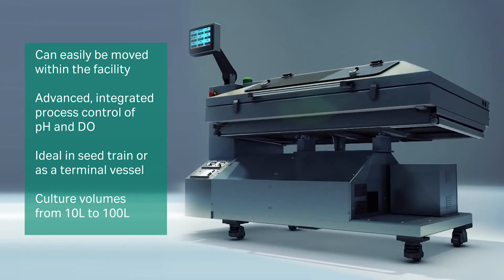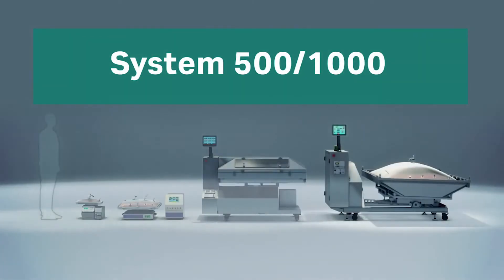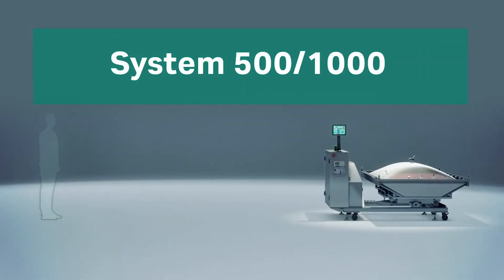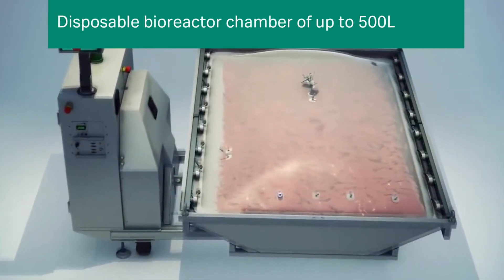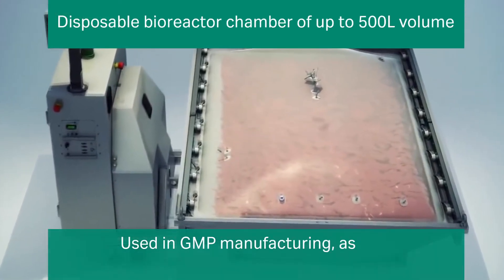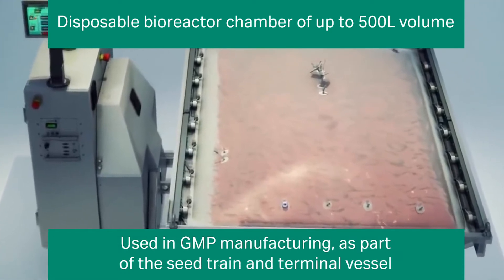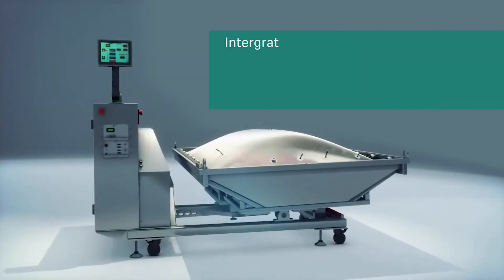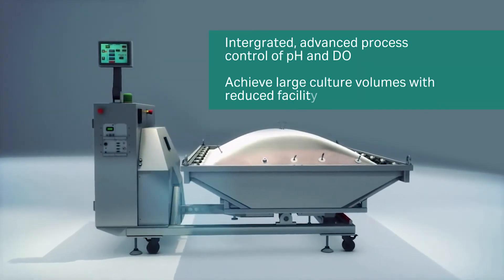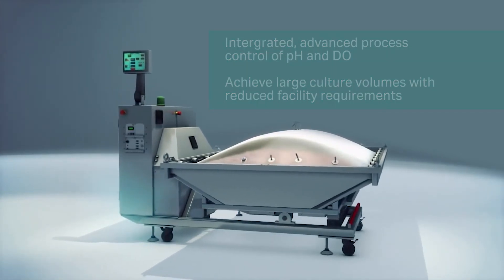Large culture volumes are possible, yet the unit can easily be moved within the facility. The largest of the Wave Bioreactors is the System 500-1000. It can handle culture volumes up to 500 liters and has been used in GMP facilities for over a decade as part of a seed train and as a terminal bioreactor. It offers integrated advanced process control of pH and dissolved oxygen. You can achieve large culture volumes with reduced facility requirements.